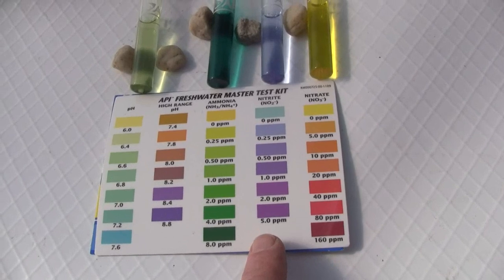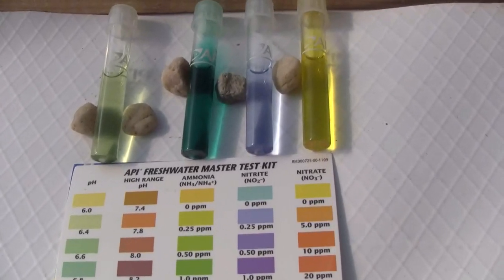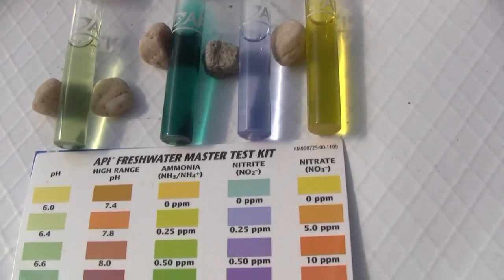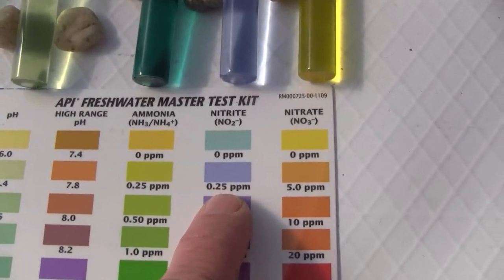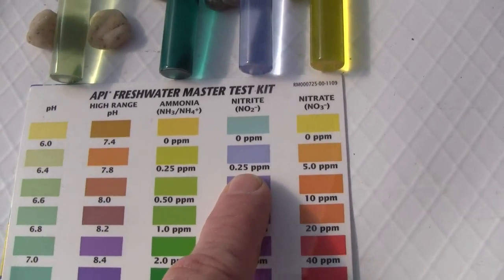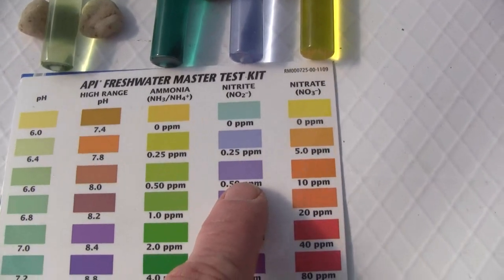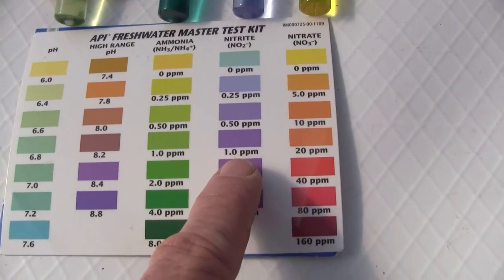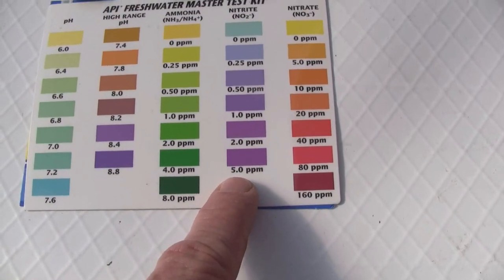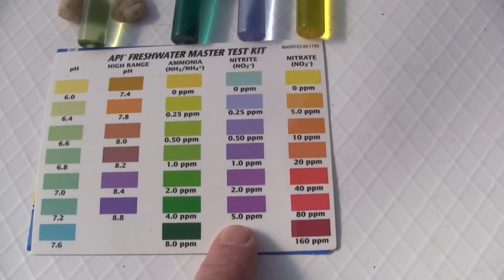The nitrite test is this third vial. You can see it's kind of a lilac color, which is this color here at 0.25 parts per million. It's different from the light blue and also different from the more purplish or violet colors that it will attain a little bit later on as the nitrite levels start to jump up.